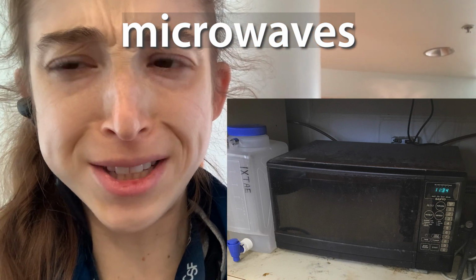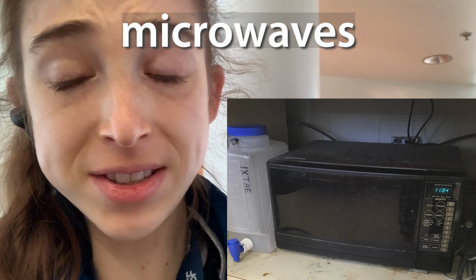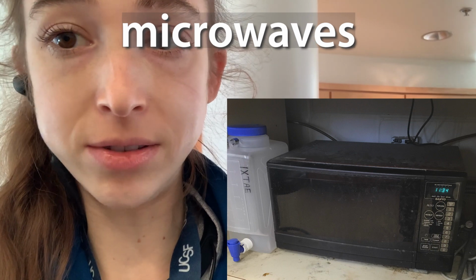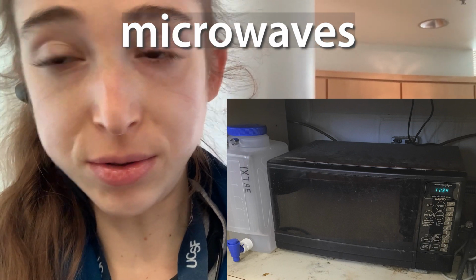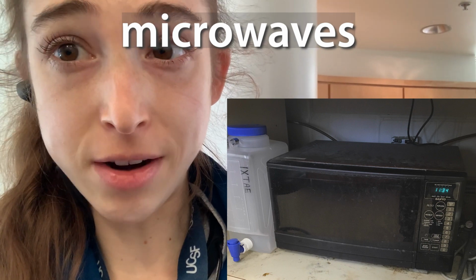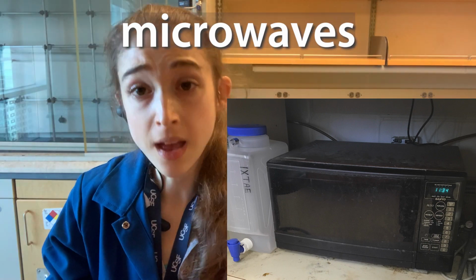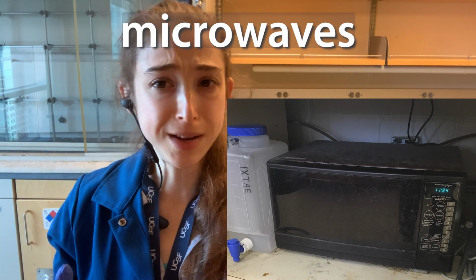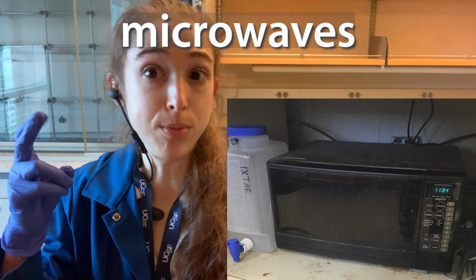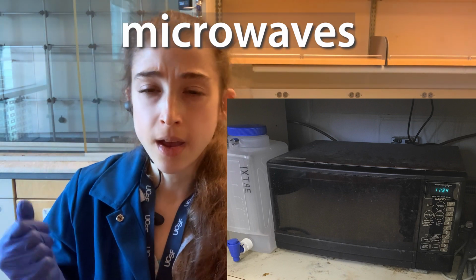I don't know how I forgot this, but the most common thing we typically use the microwave for is melting agarose to run an agarose gel. So little spurts to get it boiling, get that agarose dissolved. But again, with the microwave, we're not getting exact temperatures where we're controlling, and we're just doing it for a short time. It's not like an incubation, but we are getting things warm.